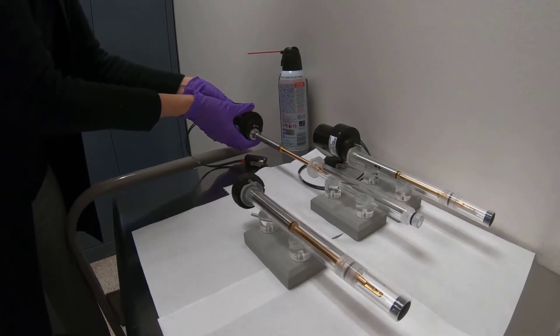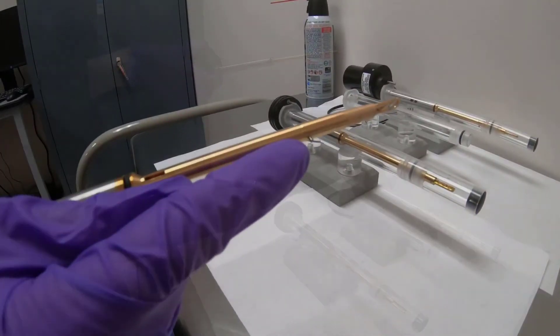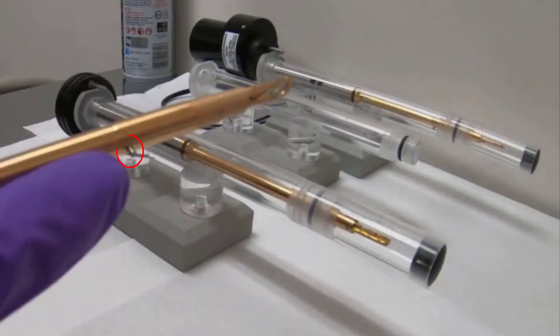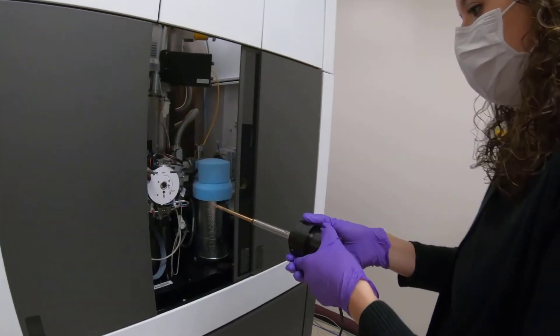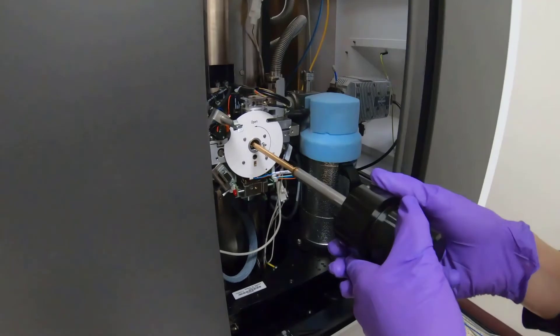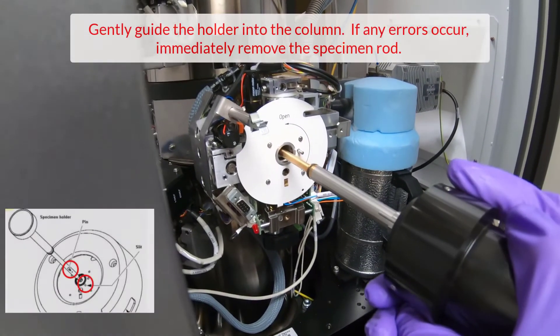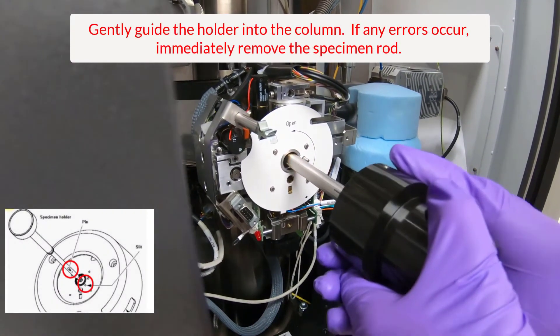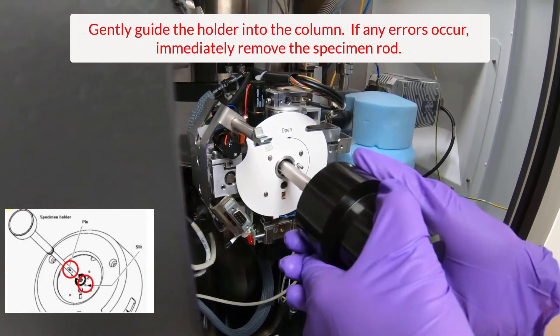Samples should already be loaded into the specimen rod. Visualize the pin on the side of the specimen rod and line it up with the slit in the airlock, which is located at approximately 5 o'clock. Once it is lined up, gently push the holder into the column.